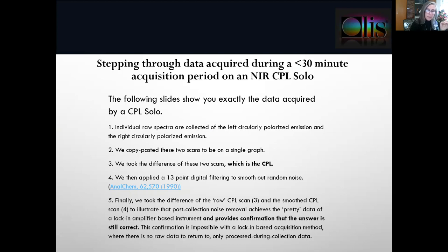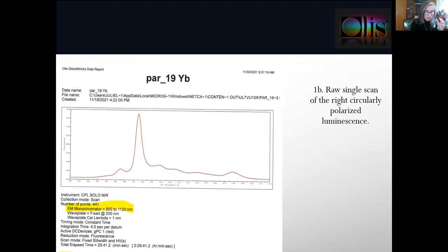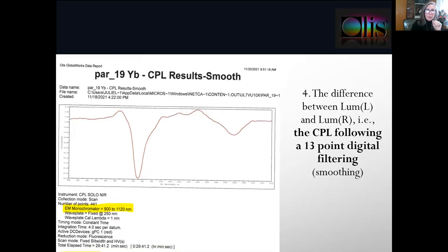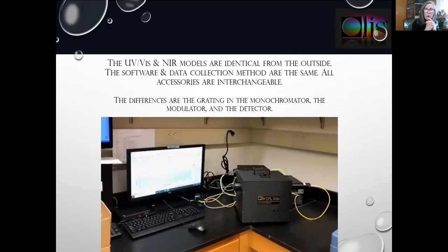This capability is available in both the OLIS CD and CPL instruments — the ability to collect the true raw information and subsequently do any cleanup if you choose to. Here we have the single scan of the left emission, then the right emission, then the two scans overlaid. There's a noticeable difference between them, which is telling us that the sample will have a CPL. Here we see that CPL — the raw information without any filtering, then with the 13-point filter, and then the difference between the two, which is completely random about zero, confirming that no structural information was changed.